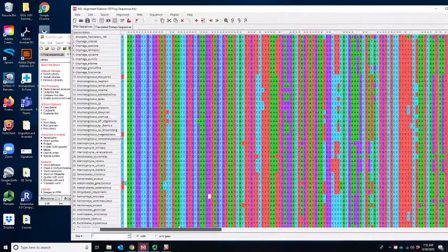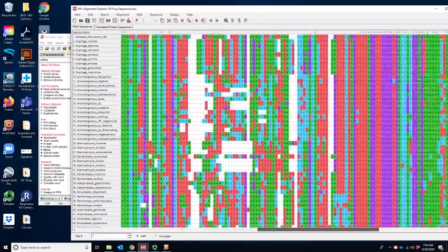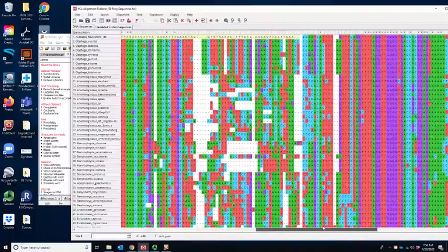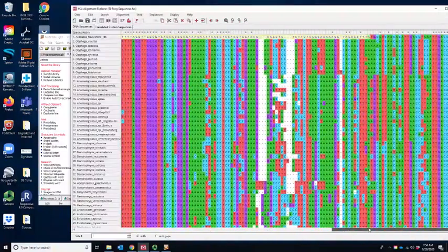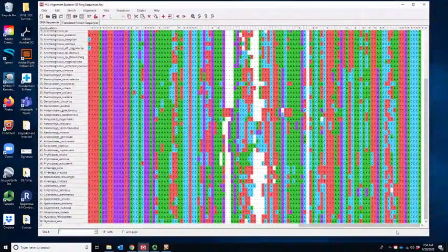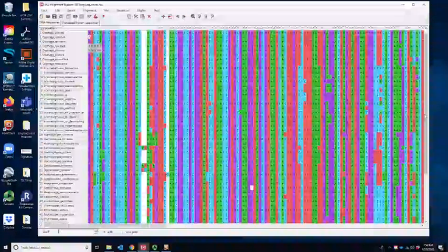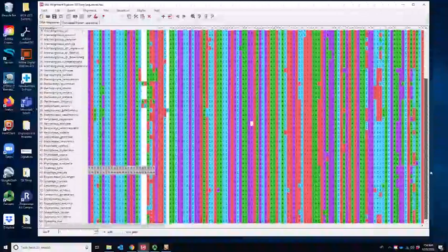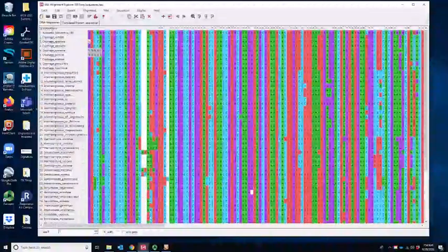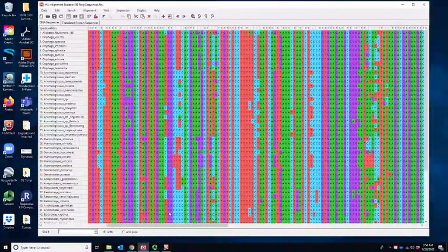Okay. Now, once you've opened it up, I want you to scan through it and take a look at it. It's not a really long piece of the 16S. This gene is actually quite a bit longer than this, but we've got a chunk of it here. And again, you will notice areas that are very conserved, in fact, maybe completely conserved across this family. And then you've got areas where there's some variability, right? So we're looking in here, then this is really good data and information for relationships.